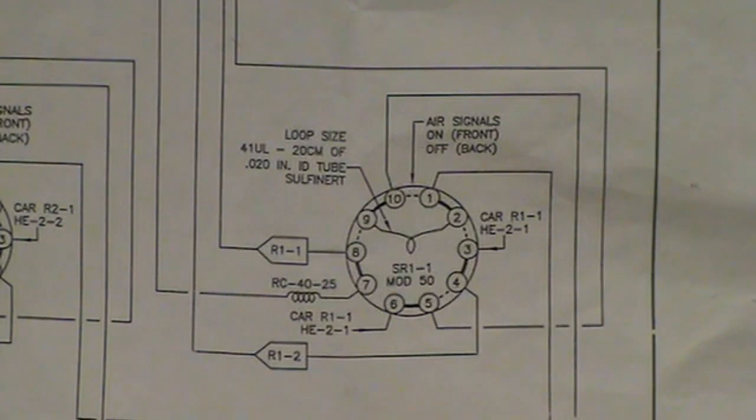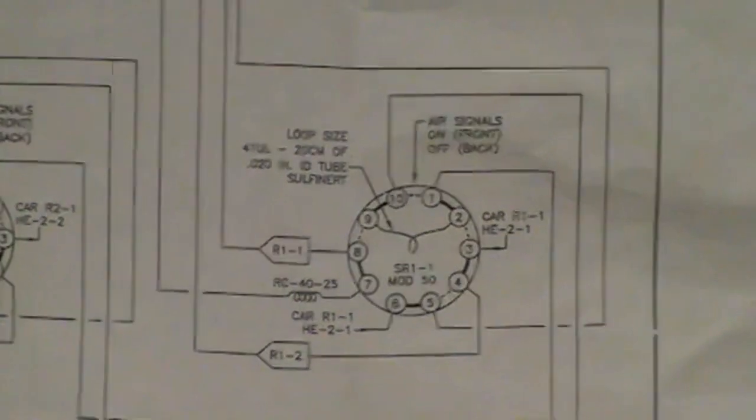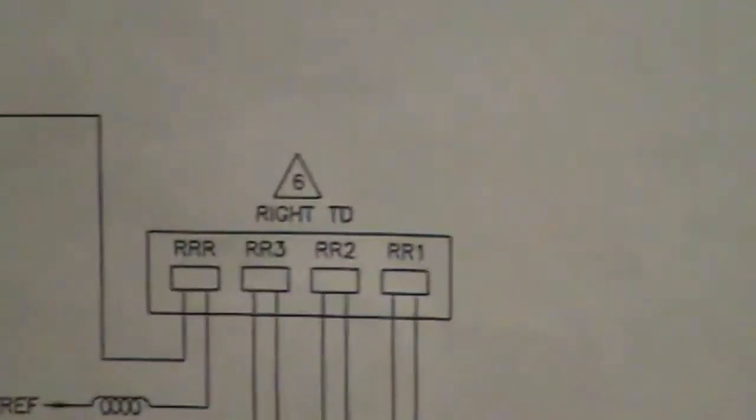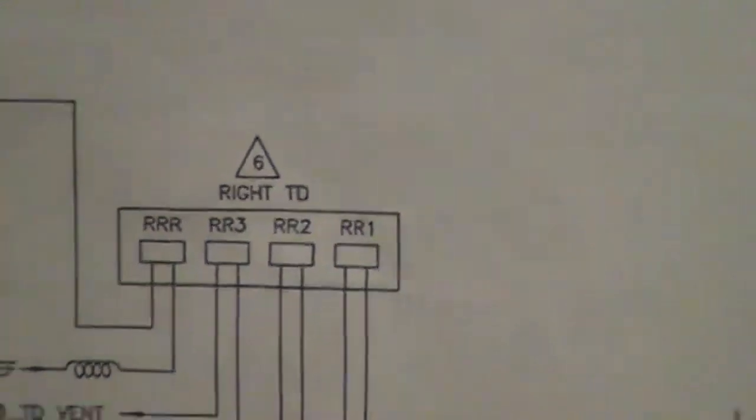Carrier gas will push our components, all of them, through column number 1, which is a pre-cut column. Pre-cut column will allow the lights to go through, and we will see them first on number 1 thermistor bead. So number 1 is a pre-cut bead.